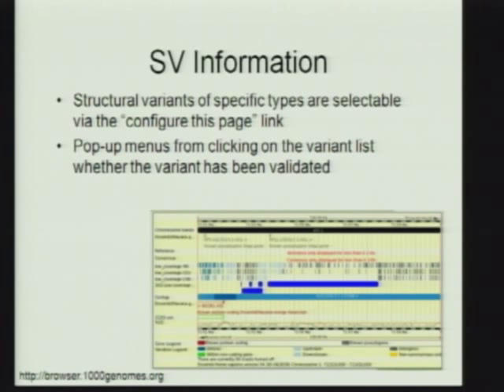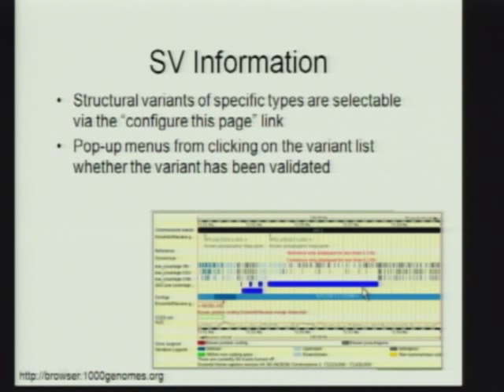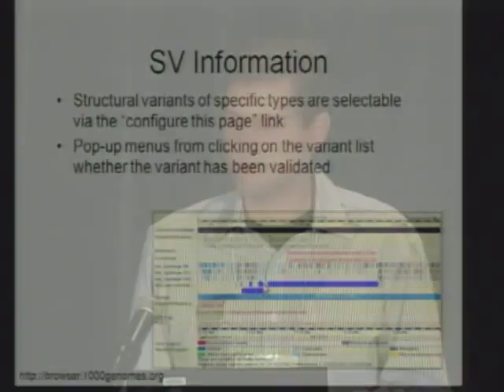We also have structural variant information. The structural variants are, as you saw earlier, in different tracks for different types of structural variants, selectable again via the 'Configure This Page' link. Once the structural variants are showing, here's an example of a larger deletion on chromosome one. If you click on it, it will give you some information on the validation status of that structural variant. You may also notice that this structural variant is actually associated with no SNPs whatsoever in the East Asian population — so things kind of tie together. That's actually a deletion.